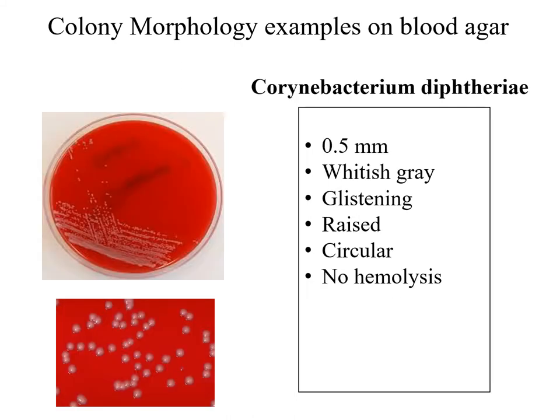This is Corynebacterium diphtheriae. The colonies are small — around 0.5 mm in diameter — whitish-grayish, and glistening. The colony is raised and circular, and it does not show any pattern of hemolysis on blood agar.